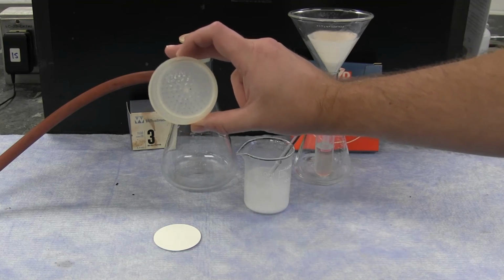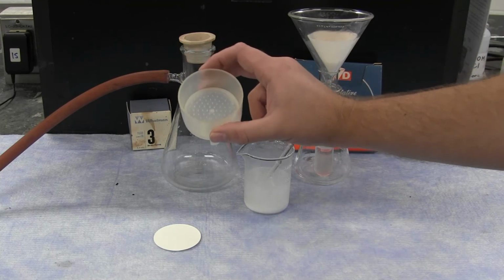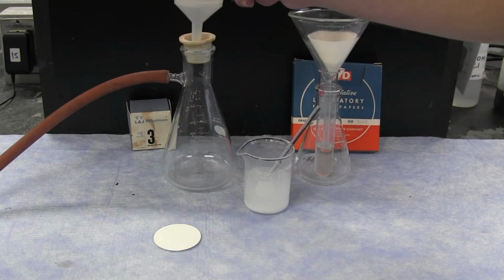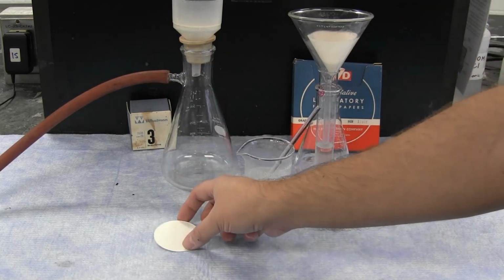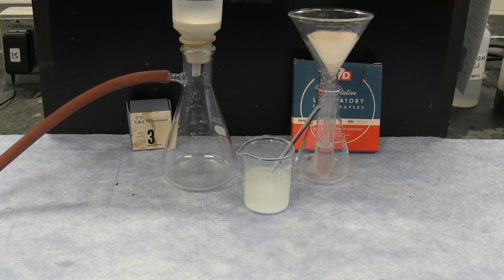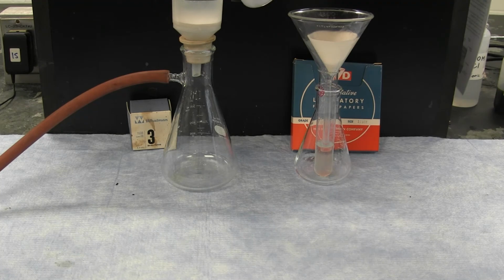Inside is filled with a number of small holes. This holds the filter paper so it doesn't pass all the way through. It's placed onto a container that is connected to a vacuum system. The circle of filter paper can then be placed inside, the vacuum system turned on, and the solution poured through.